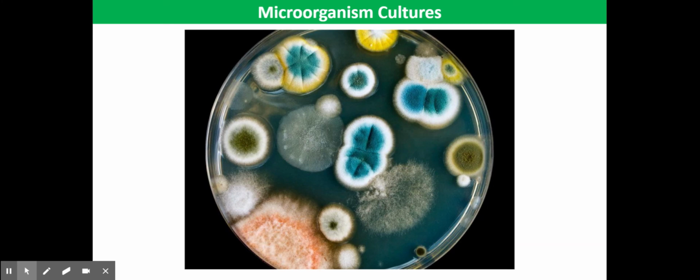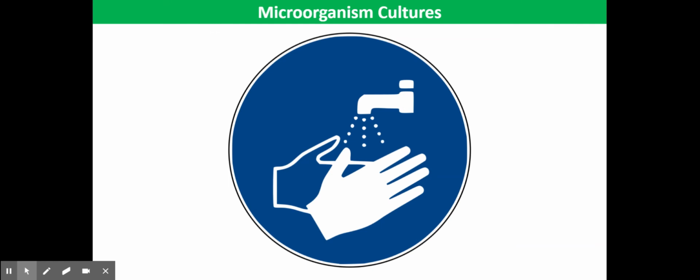All Petri dishes must be completely sterilised after use and before disposal. Thoroughly washing your hands is also absolutely fundamentally important after handling a Petri dish, as any moisture coming out of the Petri dish could be a source of infection.